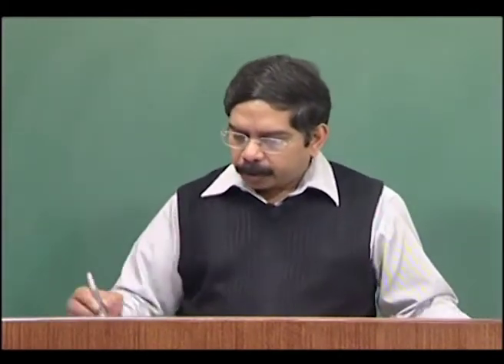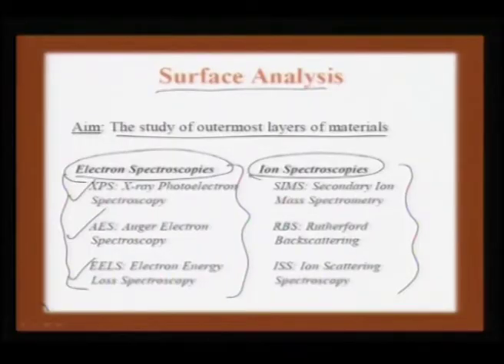electrons. We can also have ion interaction with the matter, and as a result we can come across several spectroscopic tools which can carry useful information.